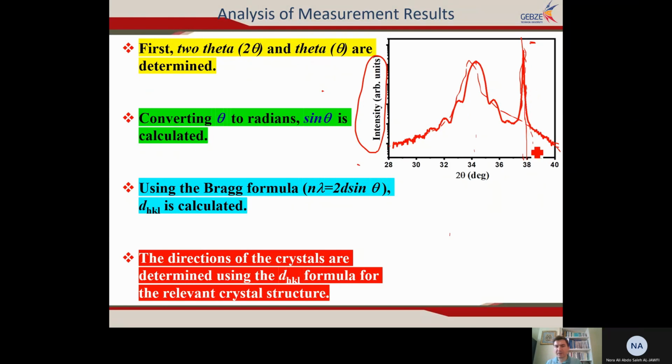Usually such sharp peaks come from single crystalline substrates, and this type of broad peak comes from the thin film grown on the substrate. This is experience. There are many physical reasons for that. Just shortly, I would like to discuss it here.